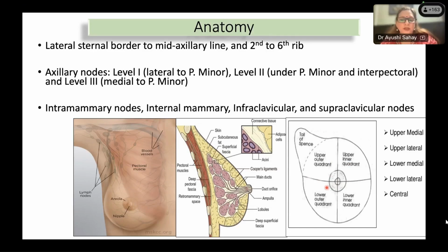So tumors actually do not follow these lines that we have artificially drawn. The lobules inside the breast can extend from here to there in any direction and do not follow the anatomical lines. There is no fascia dividing these different quadrants. This is important to remember, because the breast lobules are quite irregular structures and do not follow any other anatomical landmarks.